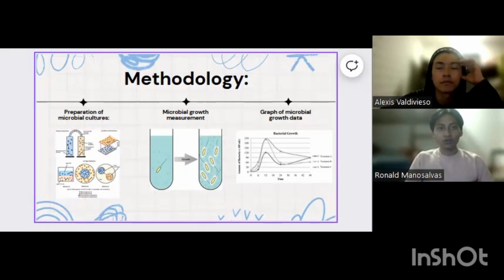The preparation of the calibration curve. Prepare a series of dilutions of the culture samples, to obtain a series of absorbance values that cover a linear range of the concentrations. Measure the absorbance of the dilutions and record the values.